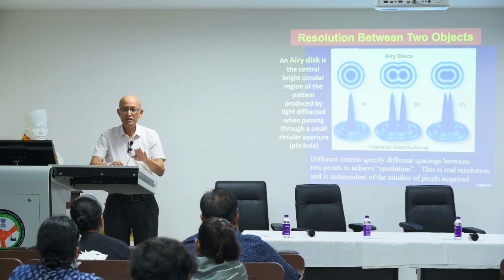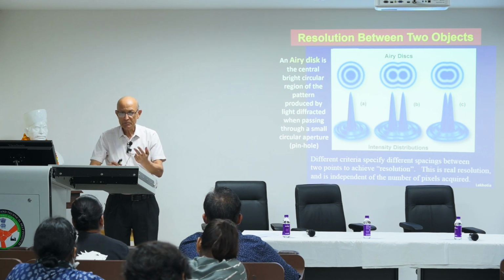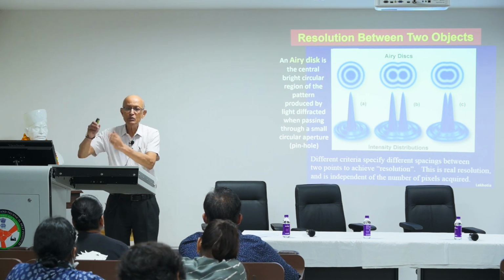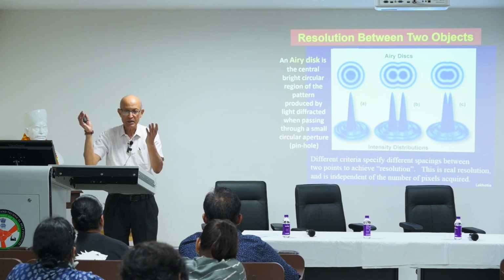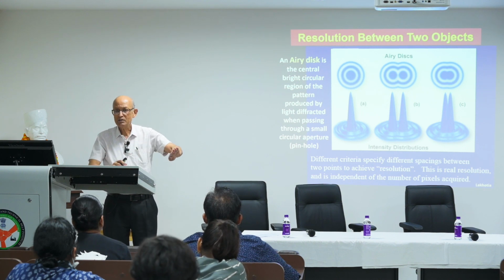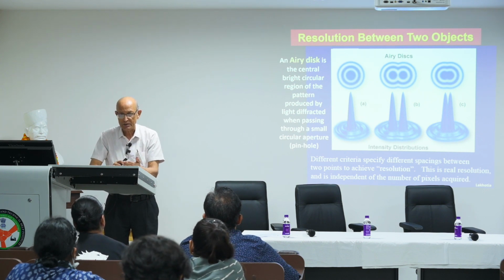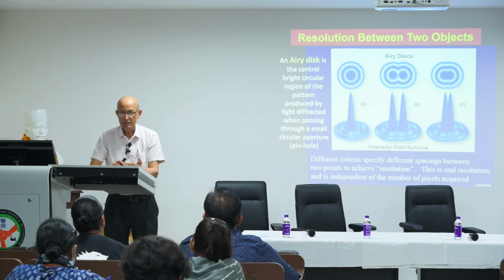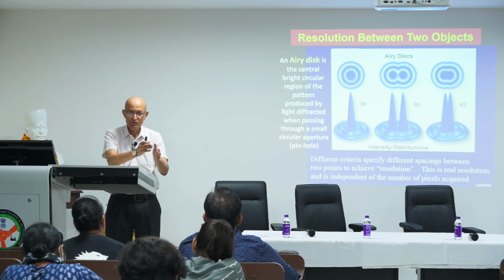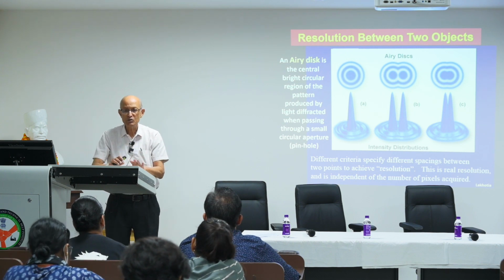Simultaneous means that you can direct your confocal microscope to use two lasers together and record each in a separate image channel. That's simultaneous. Serial is when you record one channel, then it turns off. I mean, the laser doesn't turn off, but the light from that laser is off, and you start another and repeat the same thing at the same setting. So you examine one fluorochrome, then you examine the second fluorochrome. In simultaneous, you are examining both fluorochromes together.